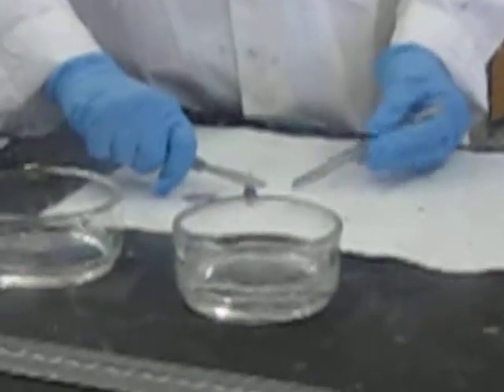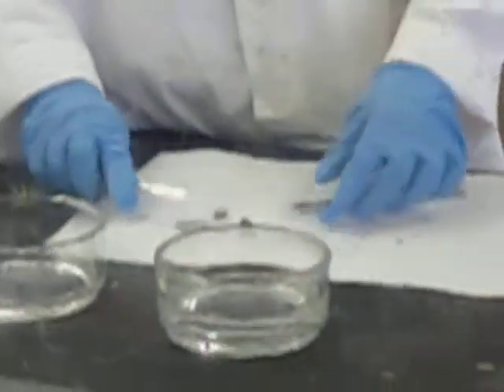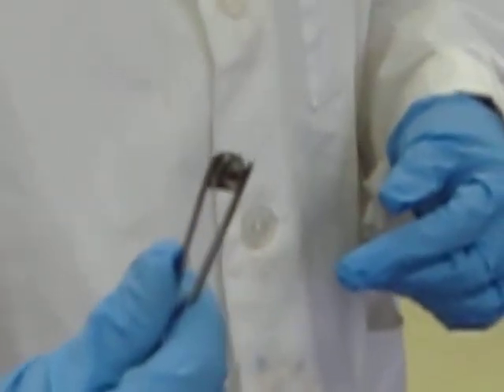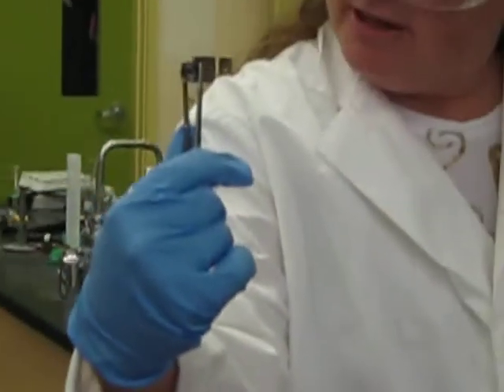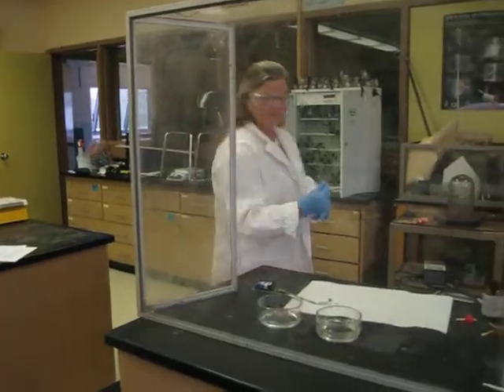So I'm just going to take this really funky, lovely scalpel, and I'm going to cut the lithium in half and expose the front part of the lithium so that you can see it. If you look inside, it should look like a metal to you. It's nice and shiny. How did you cut that? It's a really soft metal. It's not like silver or gold. So you see it's got luster, which means it's shiny, and it was malleable, meaning I could bend it with the scalpel.